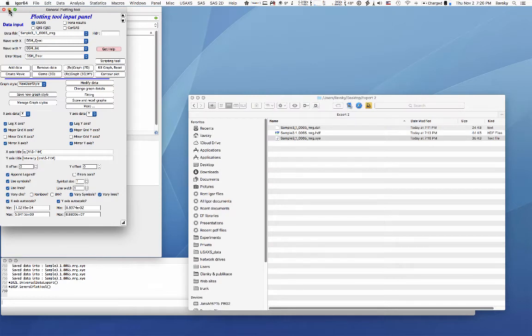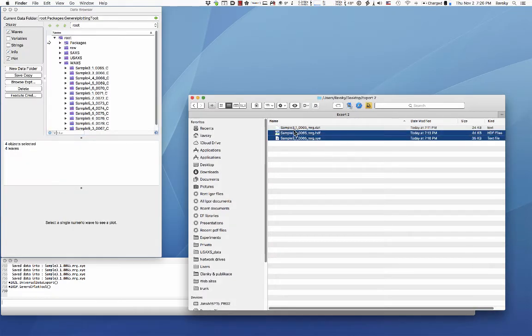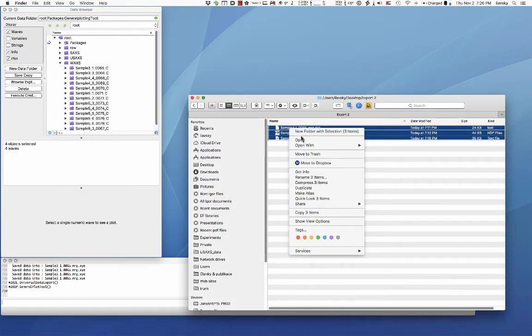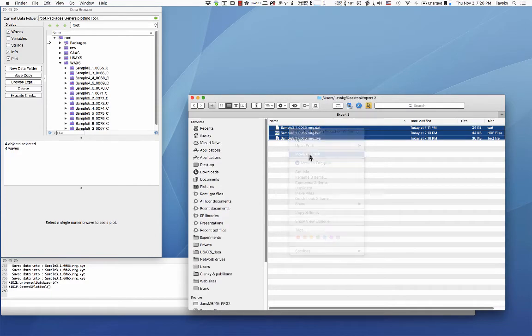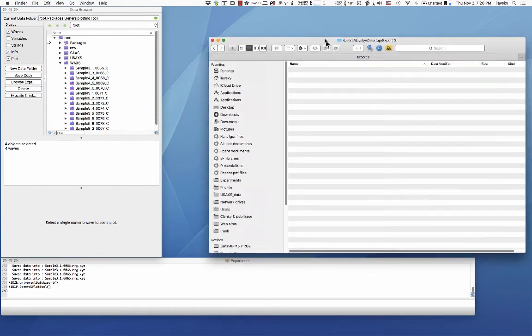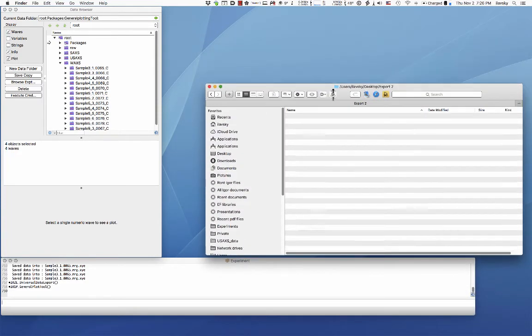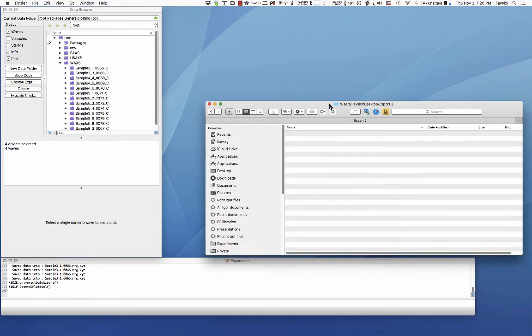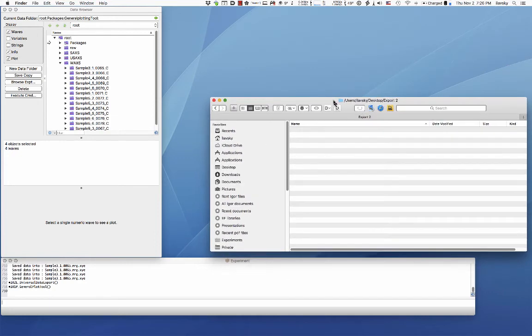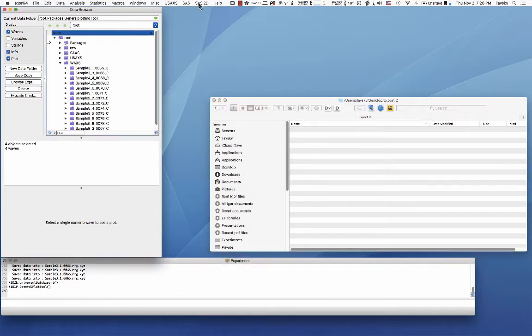Now, let's say you would like to use for analysis your own data. You would like to use for analysis of your own data, your own software. And so how do you get it out? Because you have to reduce data from my instrument with my tools. And so now you want to get it out somehow. For that purpose, the IRENA has an Export Nexus CanSAS or ASCII data. There's one panel here.